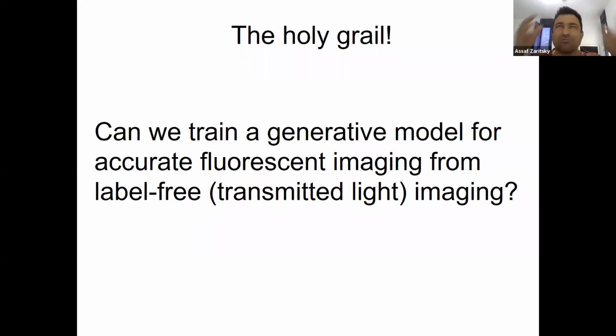Okay, so the Holy Grail: if we can take a cell and reconstruct the localization of different organelles within it, then we overcome all the technical difficulties and we can get an integrative image of a cell and start learning, really in a living cell, all the interactions and all the relations between the different organelles.